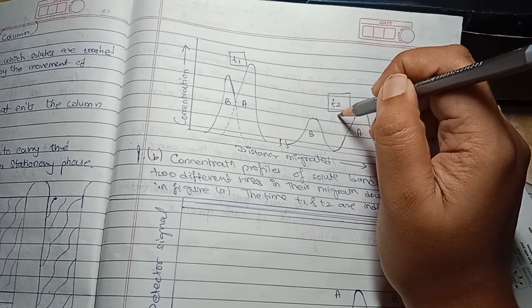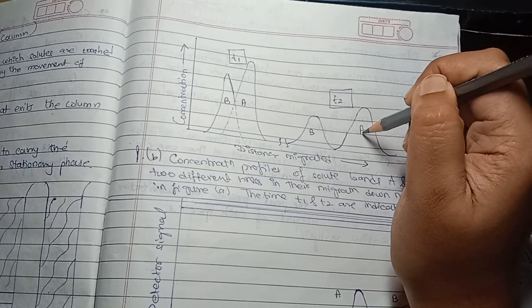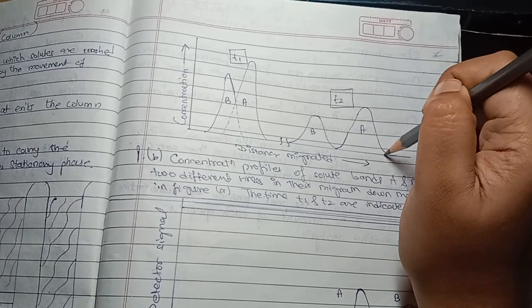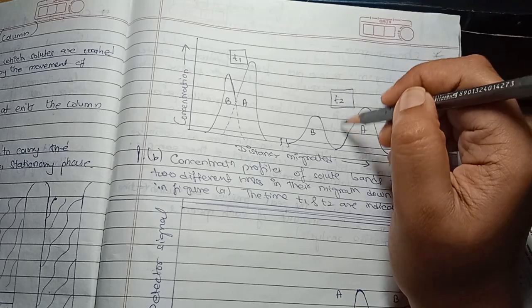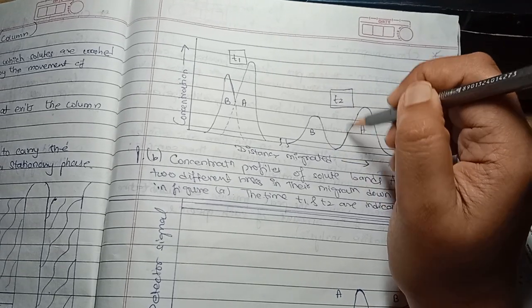Later at T2, as you saw in the diagram, both components A and B separated from the mixture, and we can see the distance migrated. Here at T2 both A and B components are separated successfully.